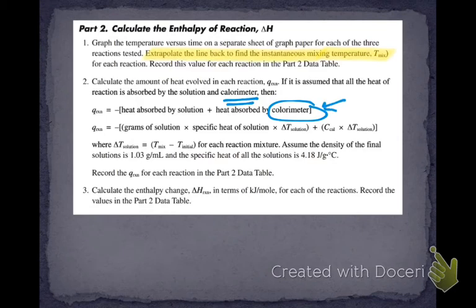So I'm not really sure what's going on there. I didn't type this. This is an experiment that I get from Flynn. So we're not using a colorimeter, we're using a calorimeter. I just want to point that out. And know that although I do make mistakes, I didn't make that one.